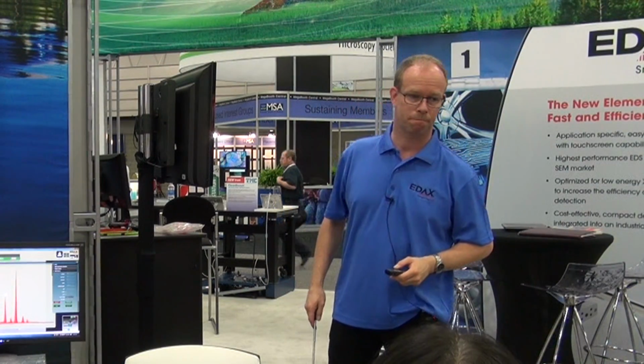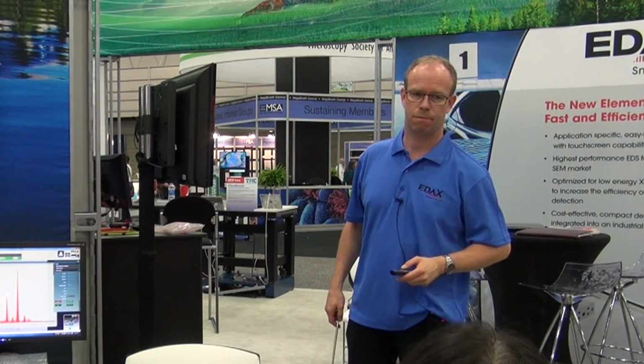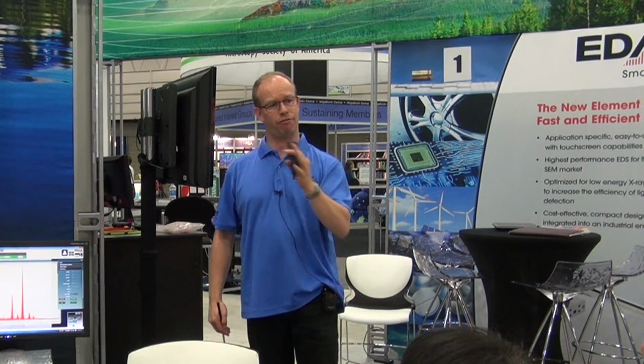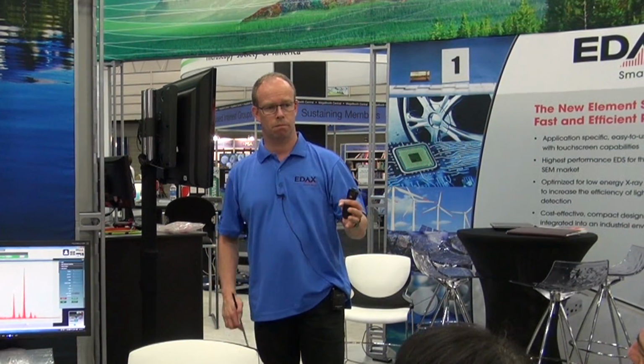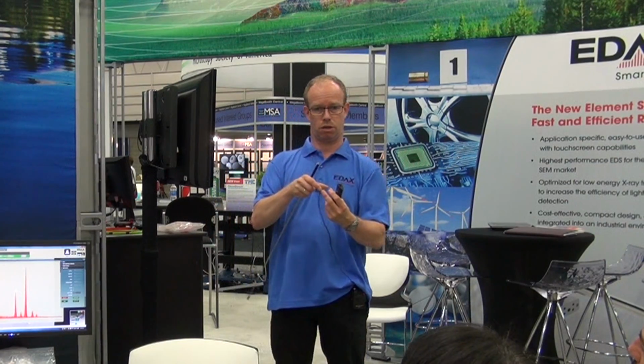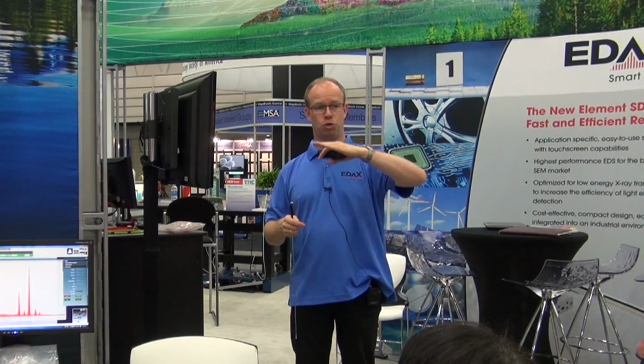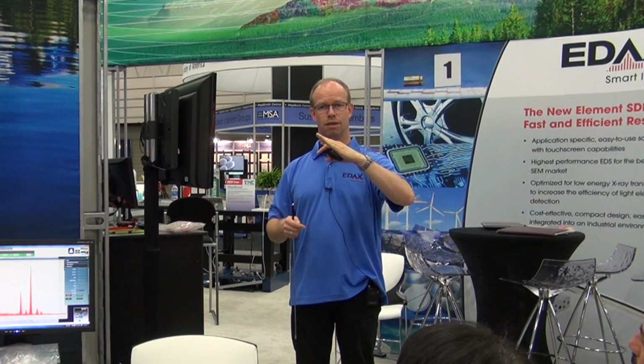In that sense, this is a little bit different than the conventional. In the conventional, it's like a fixed angle. Correct. Almost. But conventionally, you can work between 65 and let's say almost 80 degrees. But you need to calibrate the aspect ratio for that. Here you can just play around. As long as you tell the software what your angle is, you will get good data.